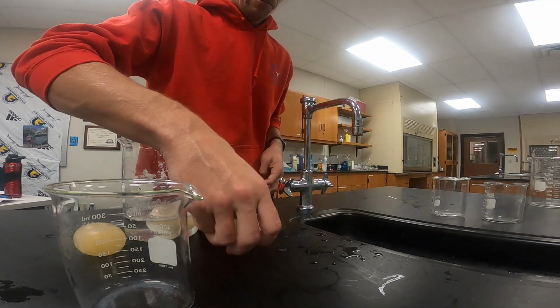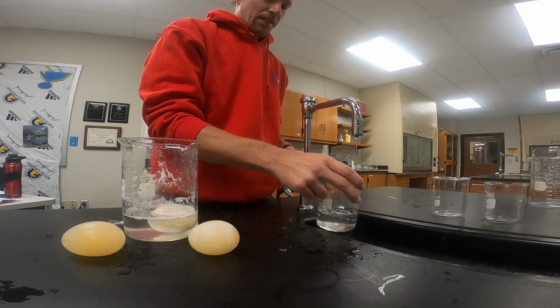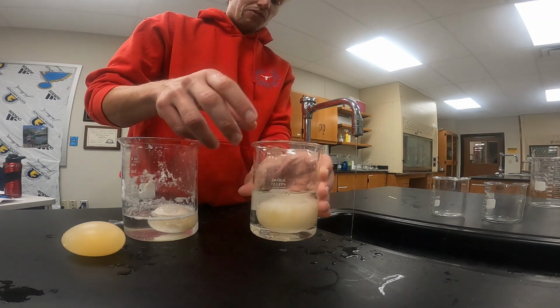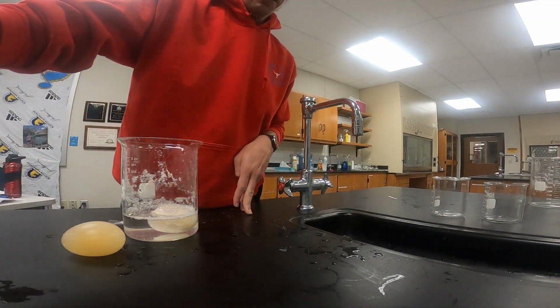So our first egg, egg number 1, is just going to go in a beaker of regular tap water. So we'll just put some tap water in, and then add in egg number 1. Make sure the egg is completely covered in water, and then let it sit for at least 24 hours, and then come back and check on it in 24 hours.